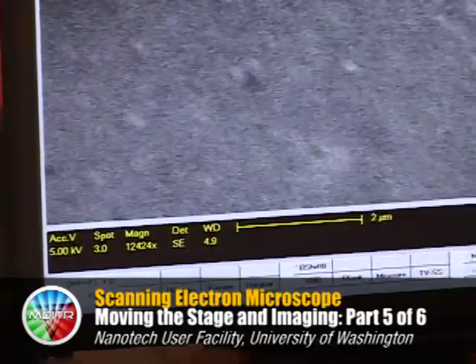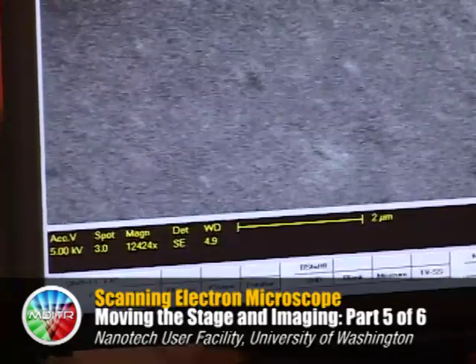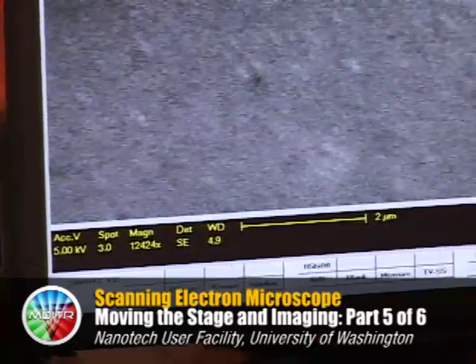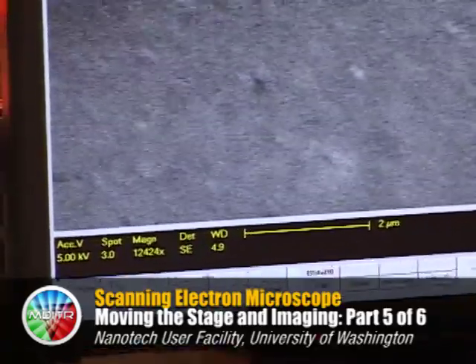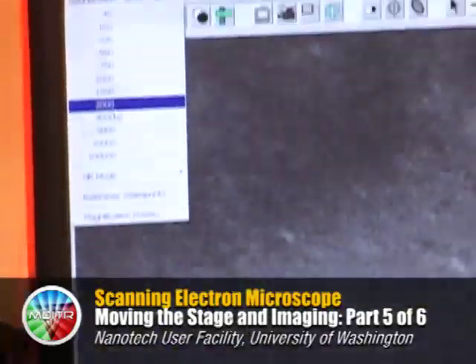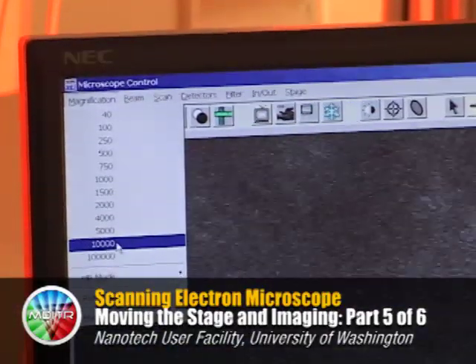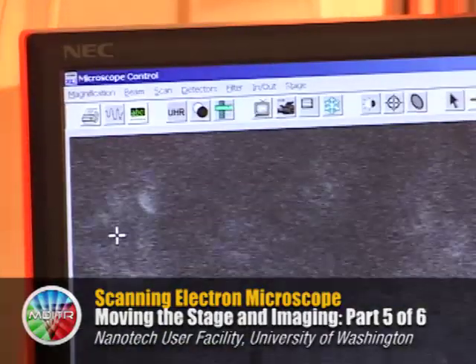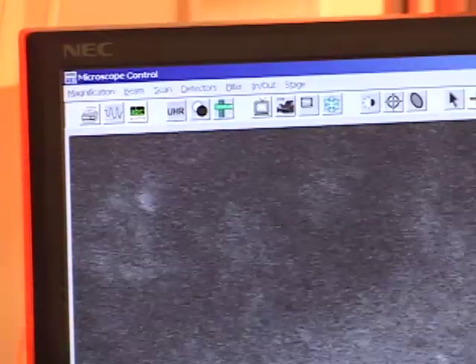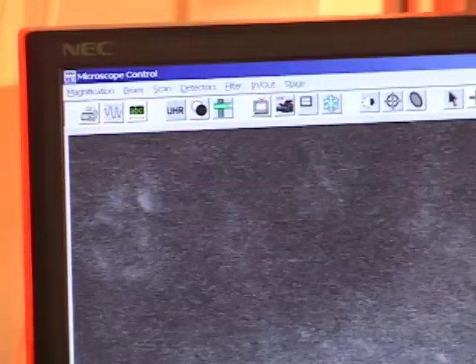If I wanted to pick an exact magnification and have a round number in the data bar, I could pick it from the magnification tab and the microscope will go directly to that magnification.